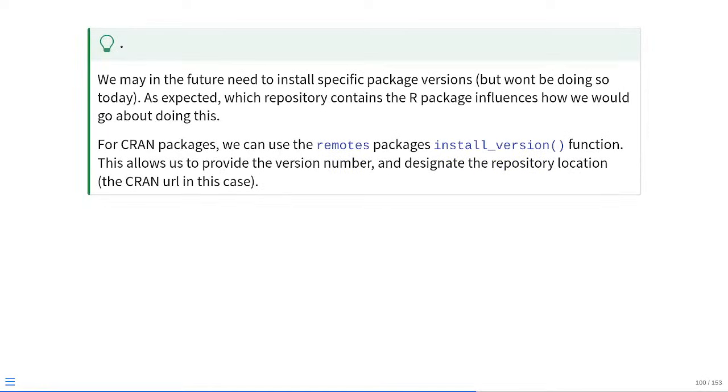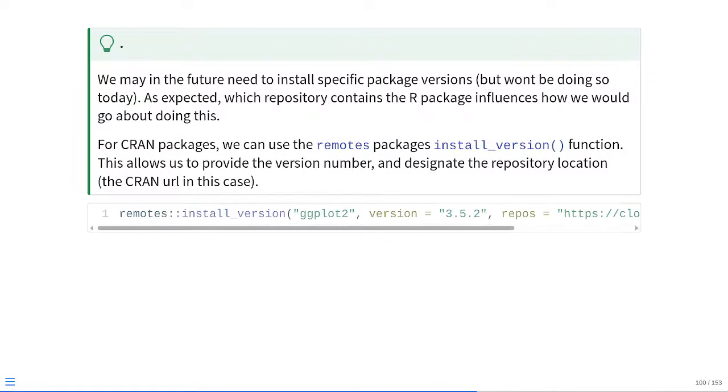So we're not going to go too far into the version numbers. I just want you to know that they exist. There's a possibility that in about 5 weeks or so, when we're using the ggcyto package, we're going to have to install some particular dependencies to get it to work. So I just want to introduce how to use these versions to be able to install a particular time point for a particular package in time.